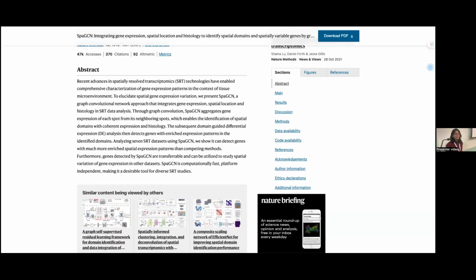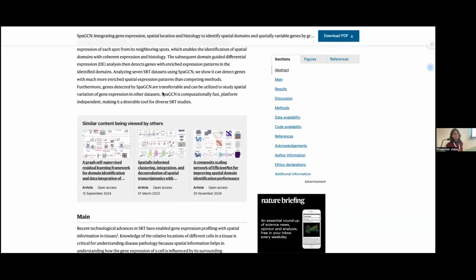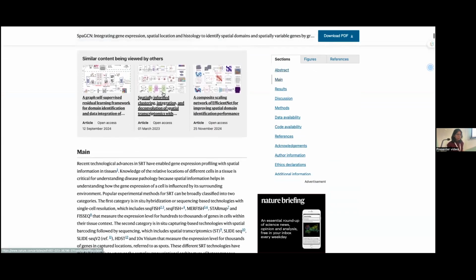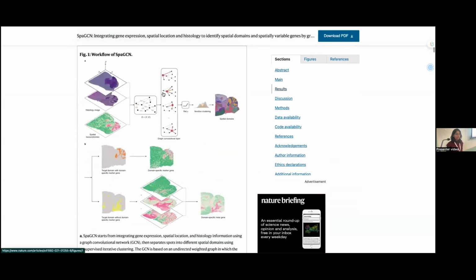Now, I like SpaGCN, and I've used it. It didn't give me better results than Banksy, but it was easy to use, and conceptually, I liked how they represented it. So for SpaGCN, they take into account your HNE. Now, how they use the HNE image is another debate altogether, all right?